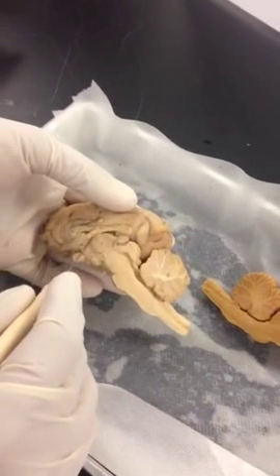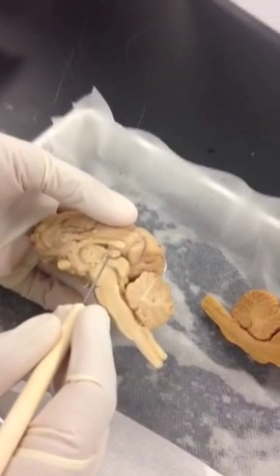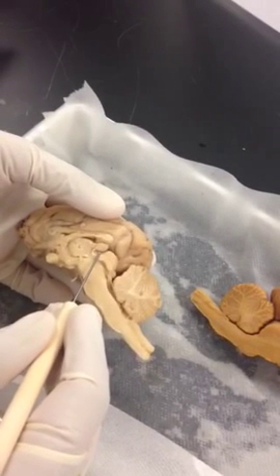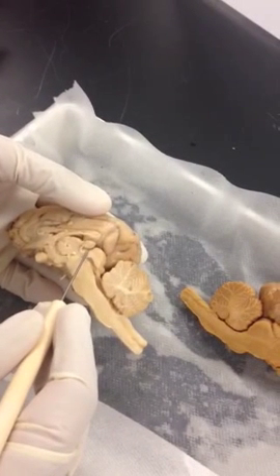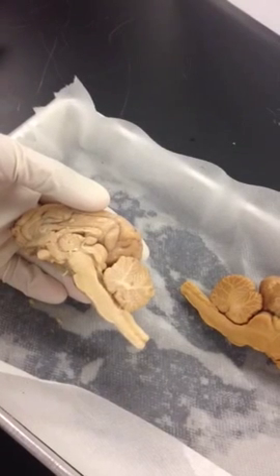If you see behind the thalamus, right here you see a little round structure. It easily breaks off too. This is another gland in the middle of your brain. This is your pineal gland. Can you see that?